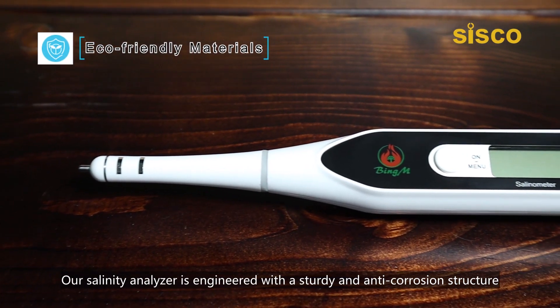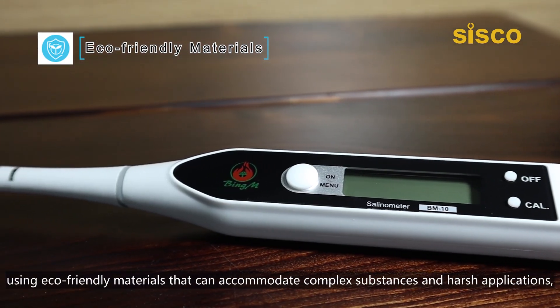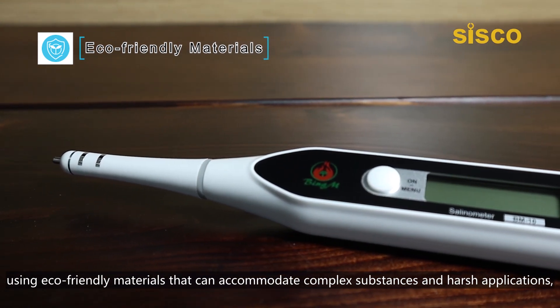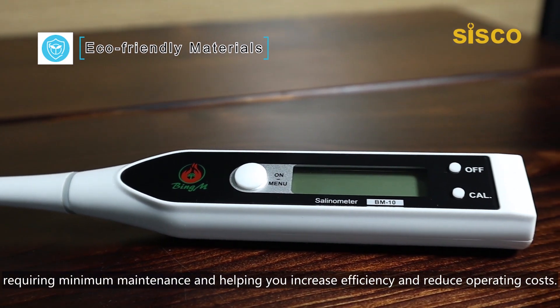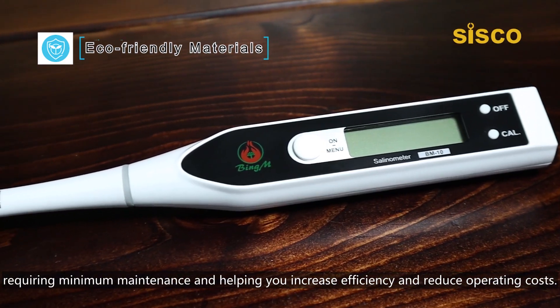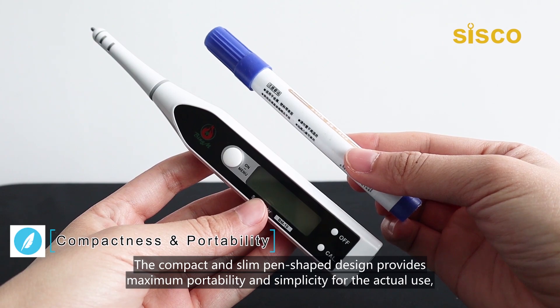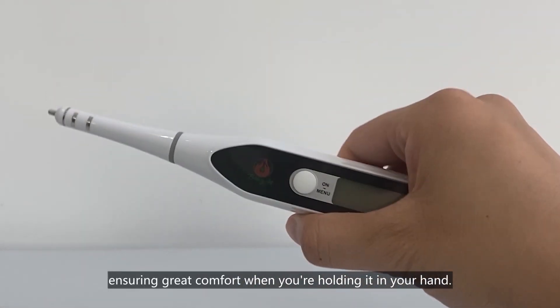Our salinity analyzer is engineered with a sturdy and anti-corrosion structure using eco-friendly materials that can accommodate complex substances and harsh applications, requiring minimum maintenance and helping you increase efficiency and reduce operating costs. The compact, pen-shaped design provides maximum portability and simplicity for actual use, ensuring great comfort when you're holding it in your hand.